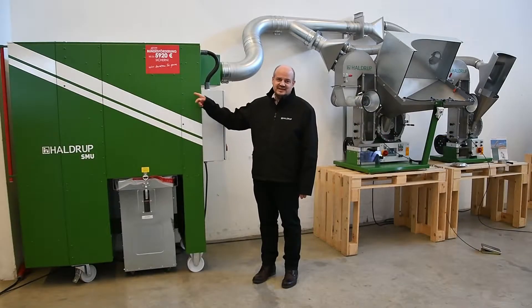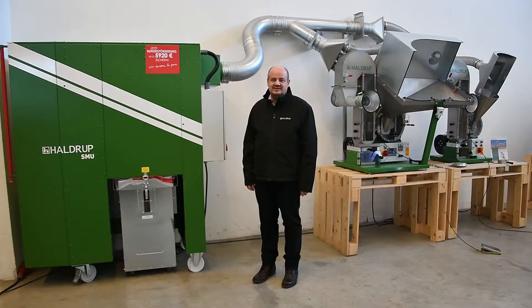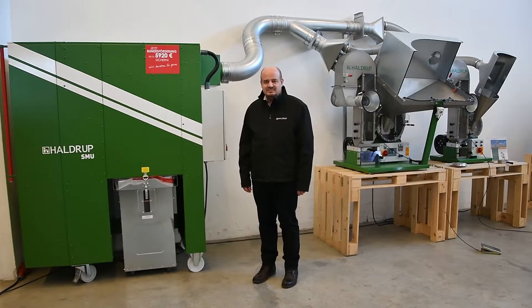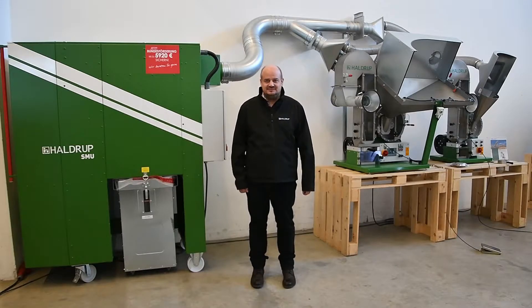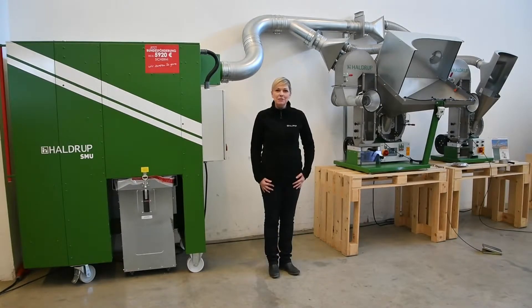This machine for dust extraction is available in different sizes depending on how many machines are connected. It is available with different attachments and adapters. We can connect this machine to our existing laboratory equipment, but we can also add it to machines which are produced by other companies.